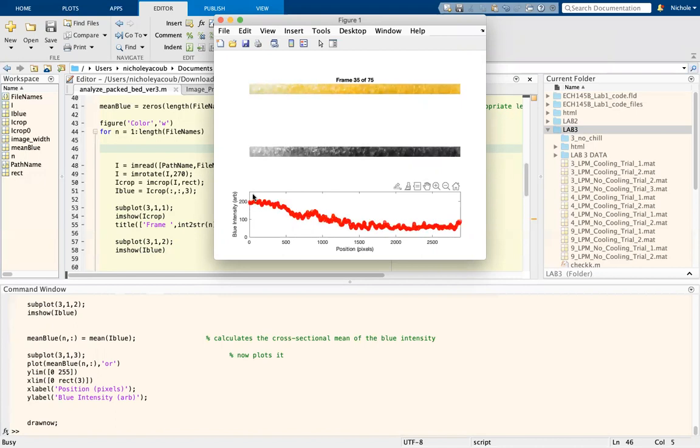And the reason for that is that there could be issues with the camera, issues with light intensity, again, deviations between different silica gel beads, causing a weird spike when you take the average of the blue intensity values. And so you actually see, especially right here, that there's a higher saturation, and that's not even at the base of the column. Whereas at the base of the column, you're having a lower saturation. That's important to remember for the next step of this process.